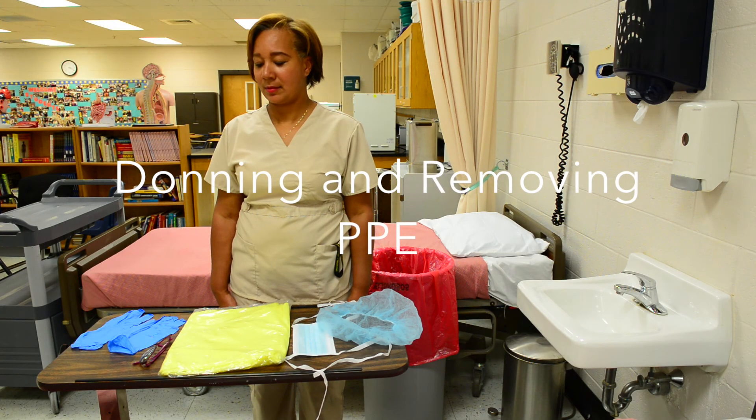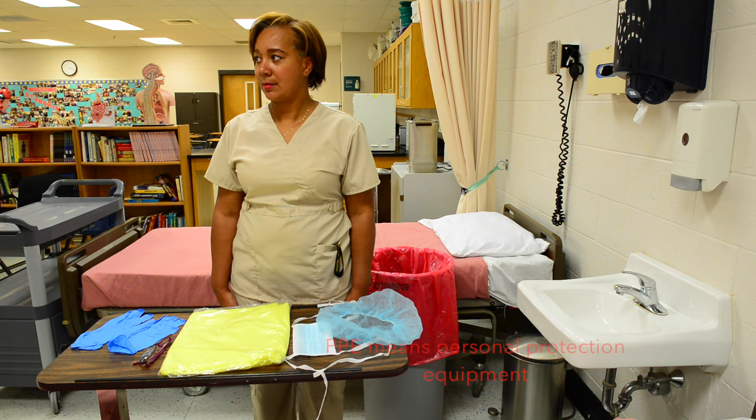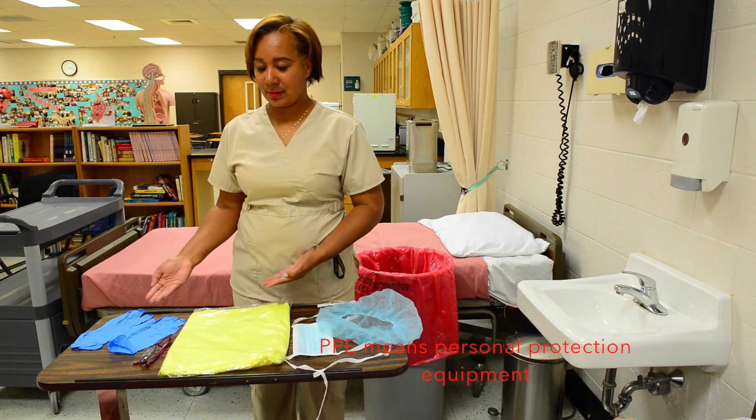This video will show how to don and remove PPE. Assemble equipment. Wash hands.